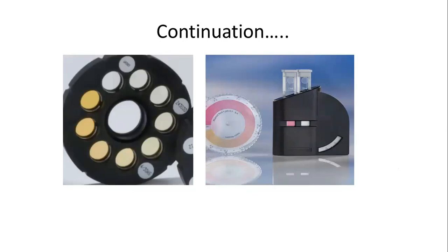So on your left, you have the color disc. The color disc contains ranges. You can have from 0 to 30 or from 30 to 70. When you're conducting your analysis, you always start from the low range disc, and then the high range disc is from 30 to 70. On the right, you have your comparator and the color viewing tubes. So, back up.